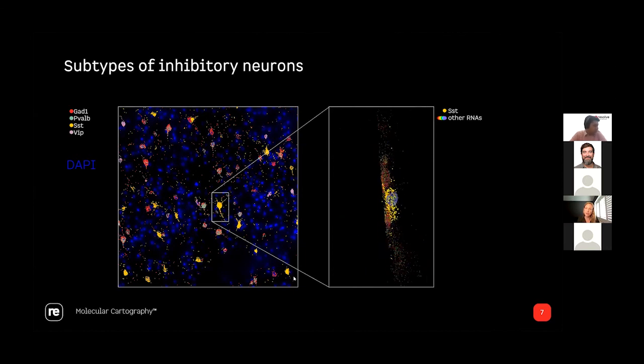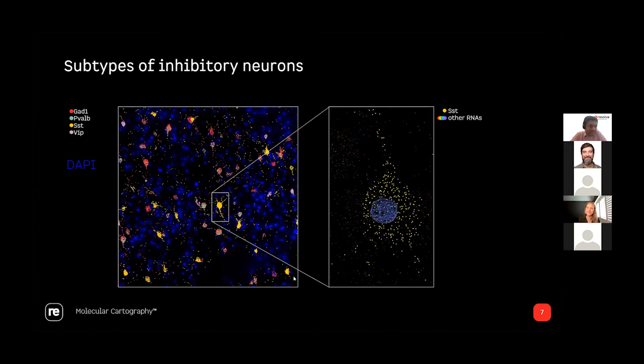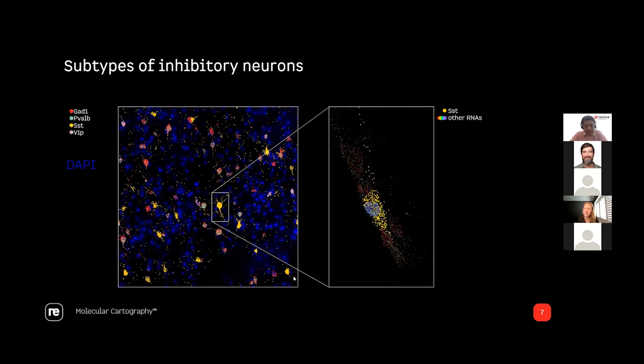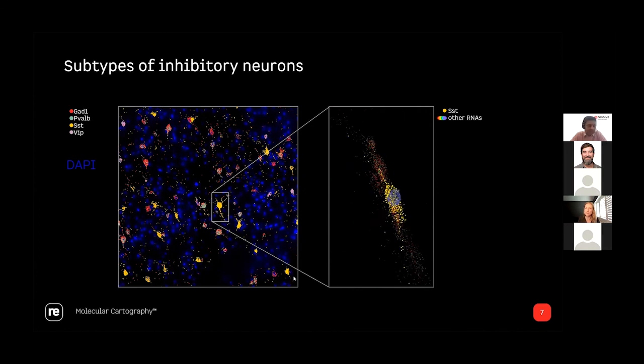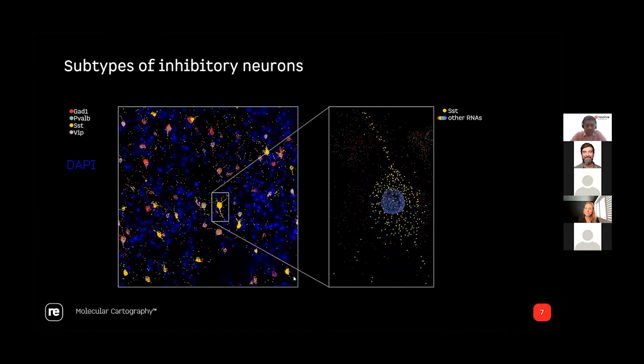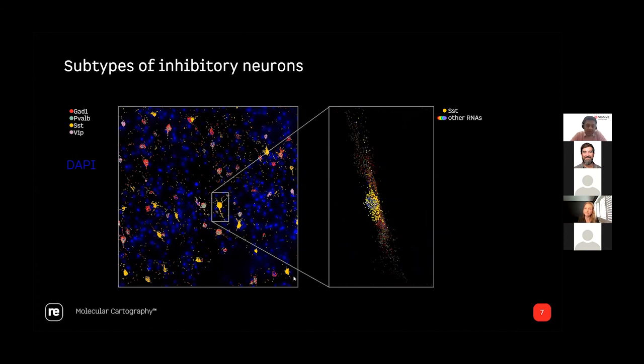Yeah. So absolutely. The thing is, of course, plaques come in different sizes, right? Exactly. And again, the data that I showed you was from APPPS1, which was of a certain age, let's say 7 to 8 months and so on. So there are going to be variations when you look into the patient data where, again, you have microplaques. How does that influence? That's something to be discovered together with the UK DRI people.